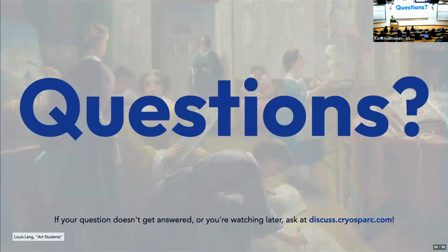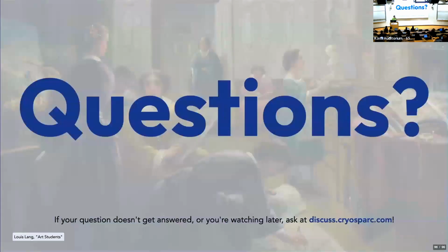In terms of doesn't that make it more complicated? I think yes and no. I think at the end of the day, talking about the black box where you push a button and get your candy, the CTF estimation is the most push-a-button-and-get-your-candy job there is. It generally just works because even though it's a complicated physics topic, it's relatively simple to model in the computer. And so you can run the job and no matter what the defocus is for all your micrographs, you'll get the right answer. So I think you're right that it is a little more complicated, but not to the user, I guess.